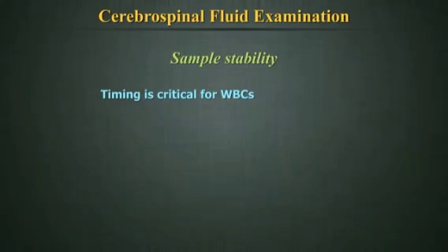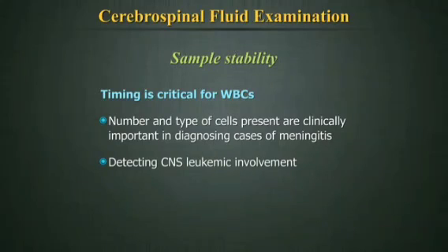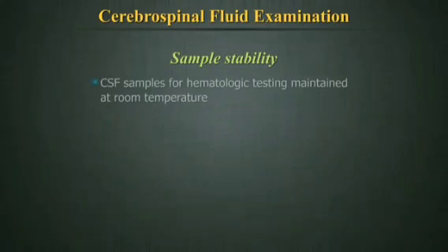Timing is especially critical for WBCs since both the number and type of cells present are clinically important in diagnosing cases of meningitis as well as detecting CNS leukemic involvement.